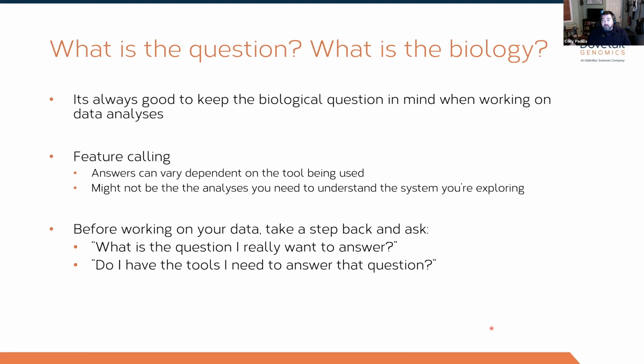One of our collaborators, they have so much ChIP-seq data that all they really needed was the HiChIP contact matrix. Don't even need to assign p-values. They just need to know what the interactome landscape looked like. They had so much supporting data that it got them into Nature Communications. It was a great piece of work, but they didn't have to do any real statistics on it because they had so much supporting data. So think about what it is that you need to know and what other data you have to support that.